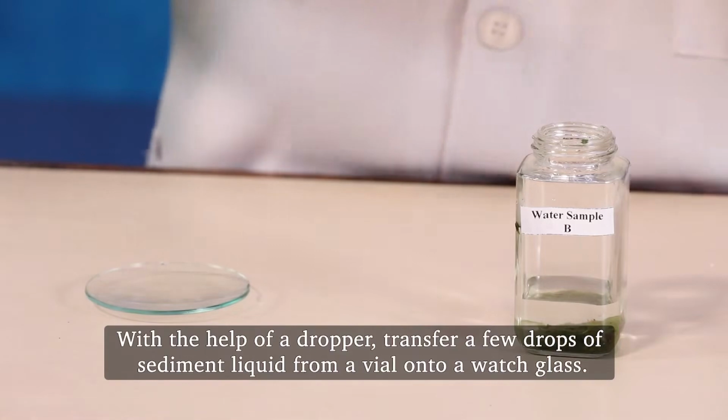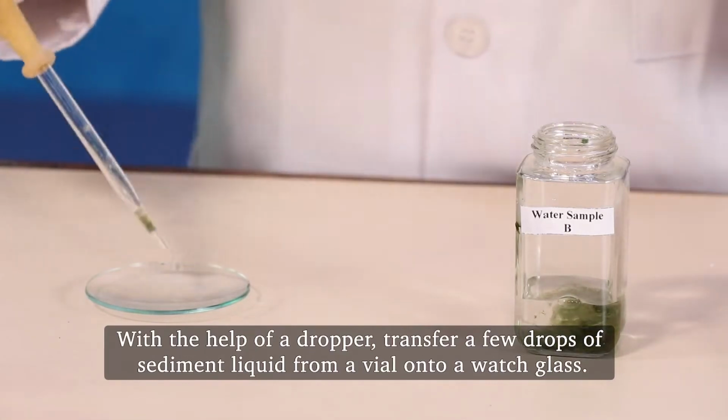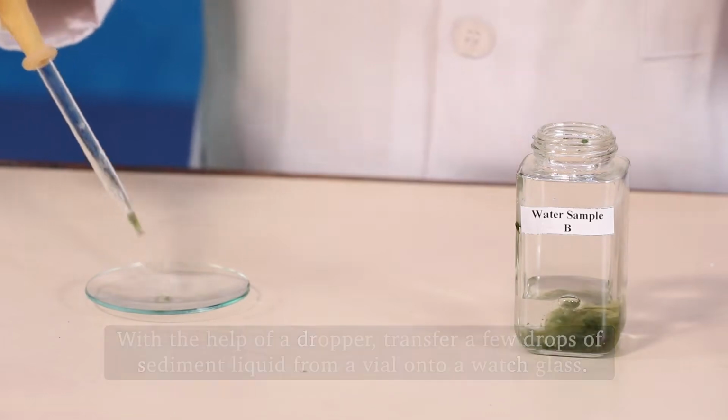With the help of a dropper, transfer a few drops of sediment liquid from a vial onto a watch glass.